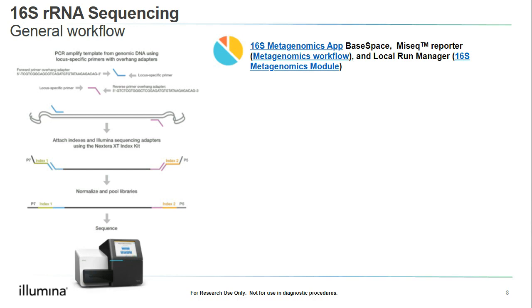If you are using a MiSeq instrument, you can also have the option to use MiSeq Reporter with Metagenomics Workflow or Local Run Manager, and that will include the 16S Metagenomics module.